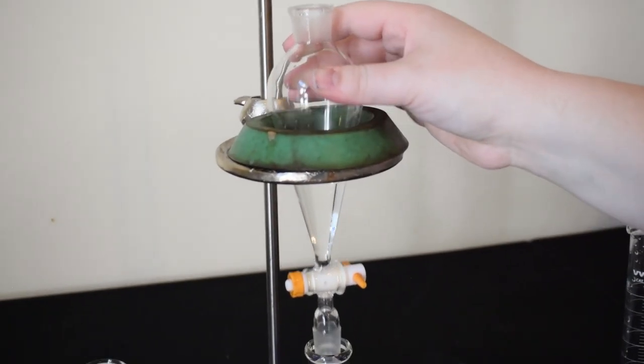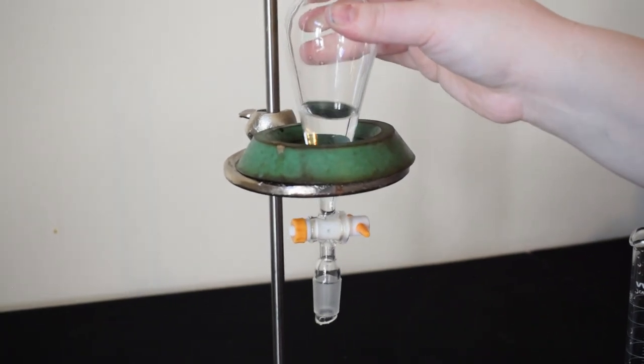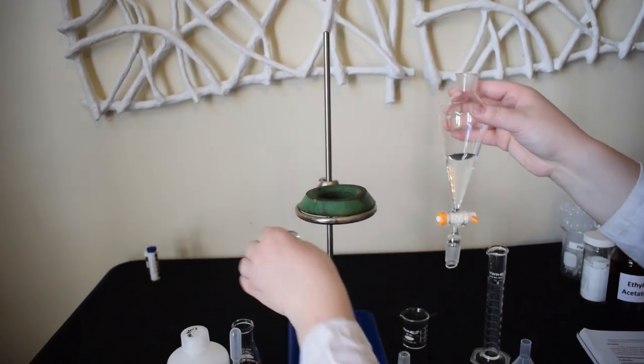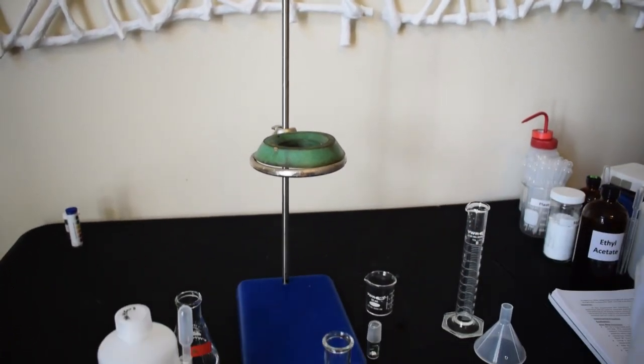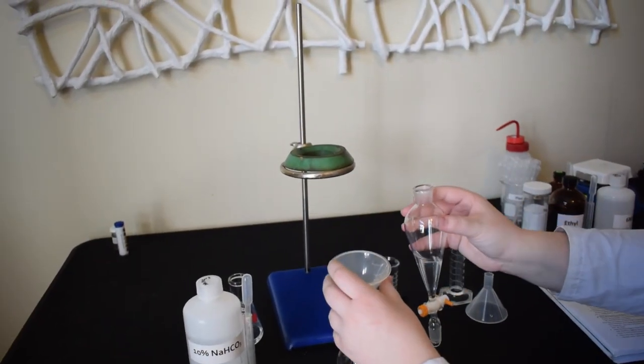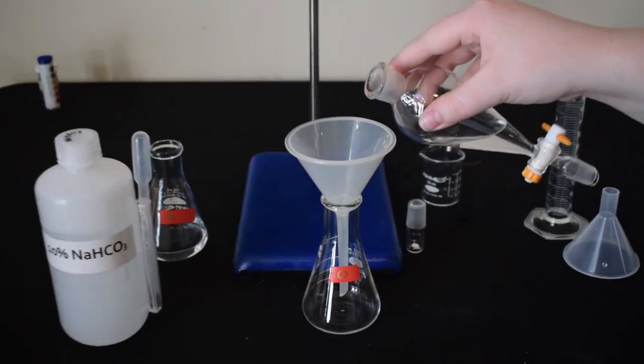Once the aqueous layer has been drained from the bottom, we are going to remove the sep funnel from the iron ring and pour the organic layer out the top of the sep funnel. This is to avoid contamination through the stopcock.